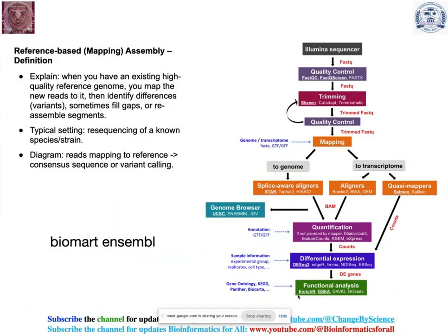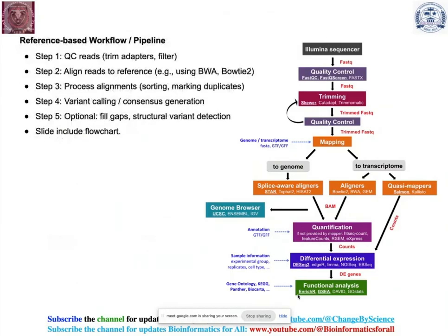It is free of cost, and that is the source present here in Ensembl BioMart. Of course, in addition to the reference genome or annotation file, there are many more applications of BioMart Ensembl, but here our concern is for the reference genome, annotation files, and some other supplementary files for our purpose.